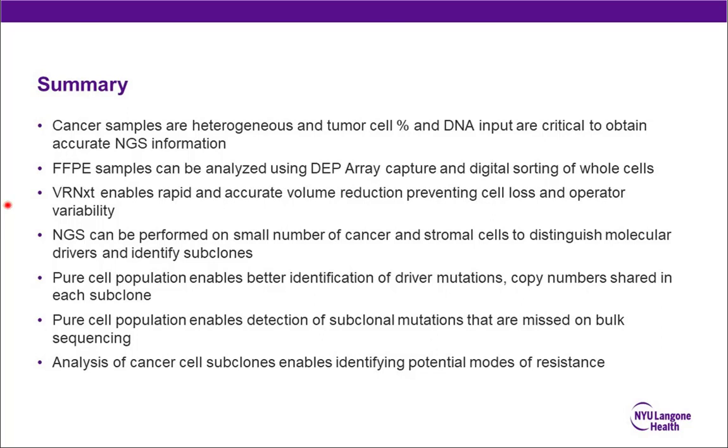Okay, and we did get confirmation from Venice that it is 12 microliters. Our next question: for preparing the samples from FFPE sections before dissociation with the enzymes, is there a step for deparaffinization? Yes.